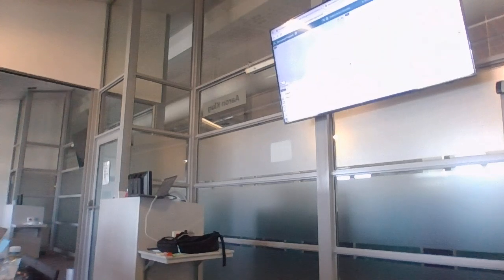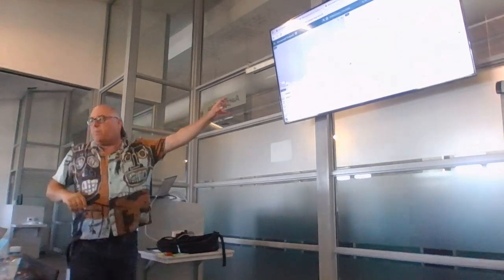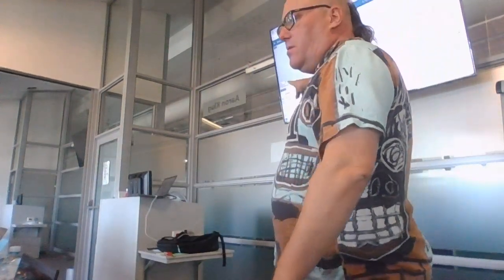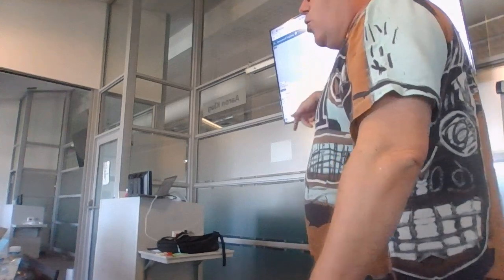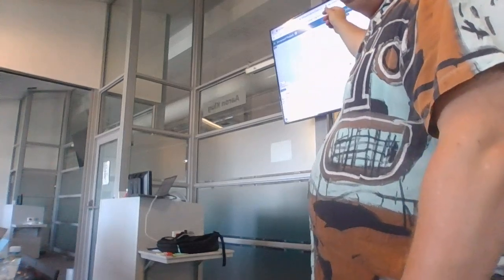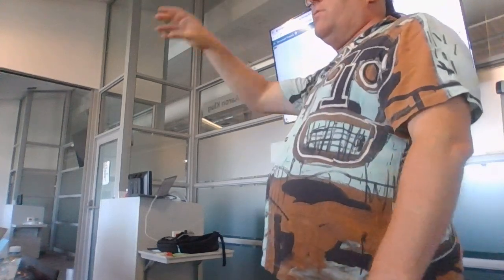Microreact you can actually use for more than phylogenetics. I've shown you an example with Microreact where there's no data in the metadata, but you can also load metadata into Microreact where there's nothing in the tree, and so you can use Microreact to visualize your cases.